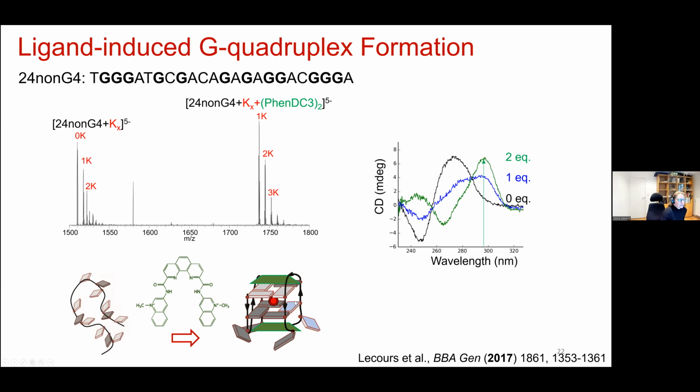sequence. Well, here the cartoon, I don't really know the sequence, except that, again, it's antiparallel. That it folds in, it manages to grab a cation and arrange its guanines to form a 2-quartet G-quadruplex of some sort that is, again, antiparallel.